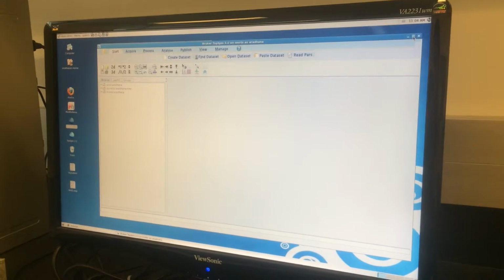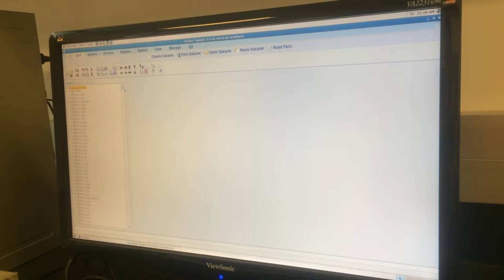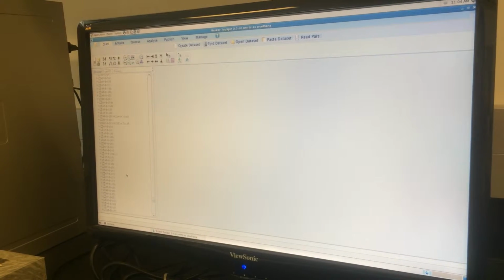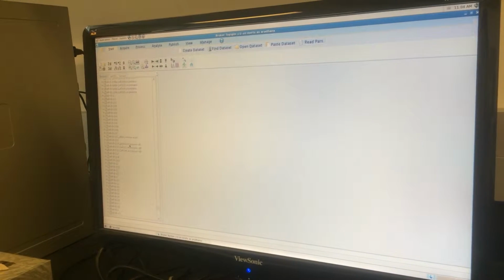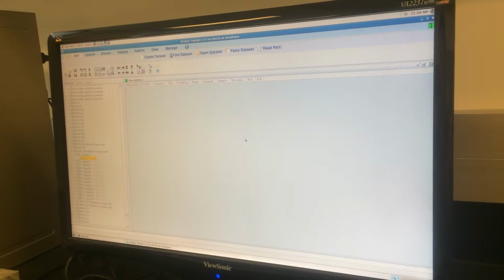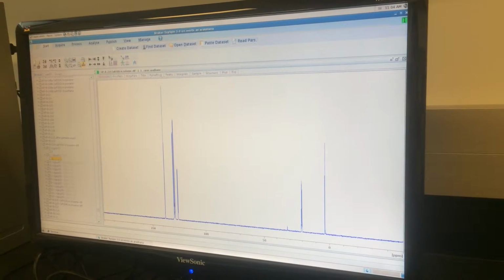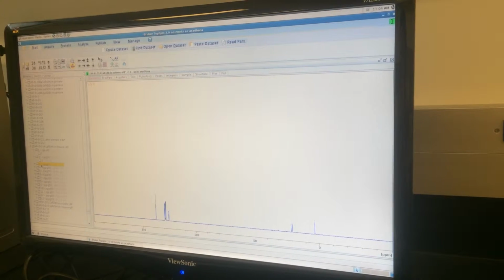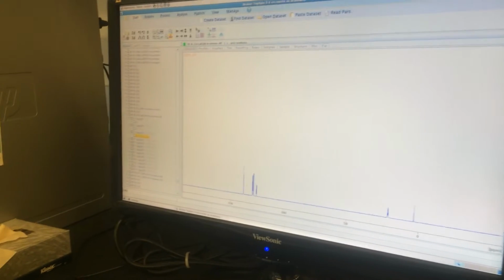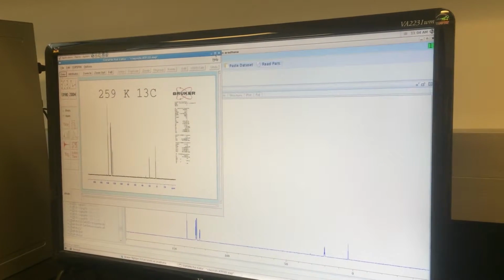So when you open the Topspin 3.0, you open the NMR in the folder, and then you process each and every NMR. If you have to do the phase correction or axis calibration or something, you do it for each and every NMR. Once you're done with all of that, you type XWP in the command window and you hit enter, and then a new window opens up.